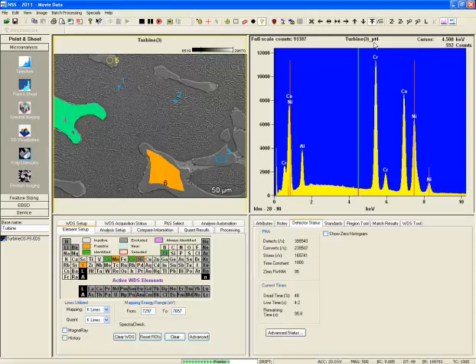You can see that the color scheme in the image changes. The previously acquired points are a light blue. The current acquisition is a green. For instance, point number 5, the circular area, is a green area. The future point, point number 6, is more of a yellow-orange color. That is done for each one, so it's visual feedback to the user of the regions that have been acquired and the future regions to be acquired. So this is the completion of point number 5, switches to point number 6, the color changes, the spectrum displays, the peak IDs are presented, and then the quantitative analyses.